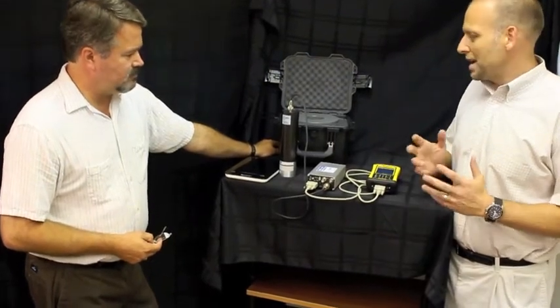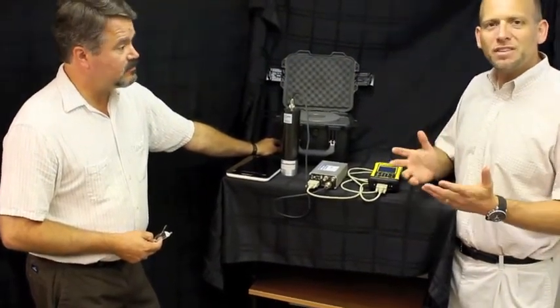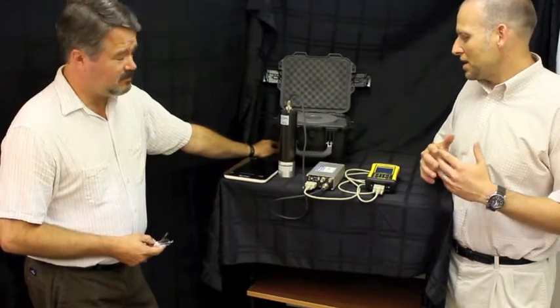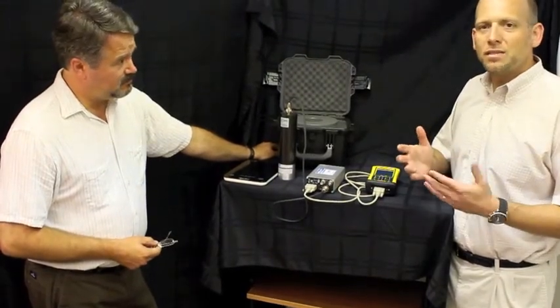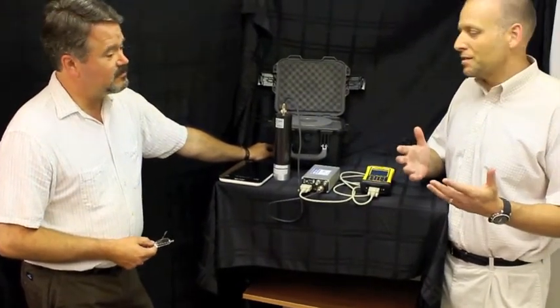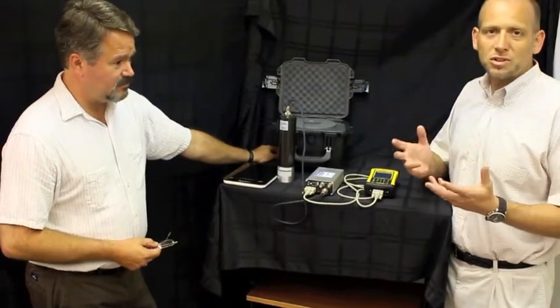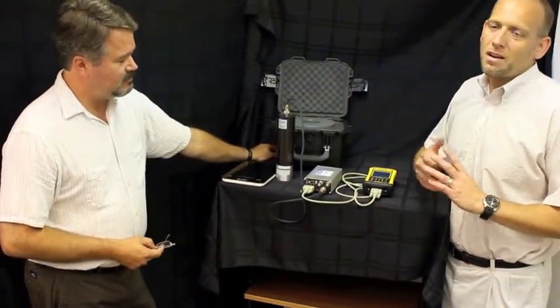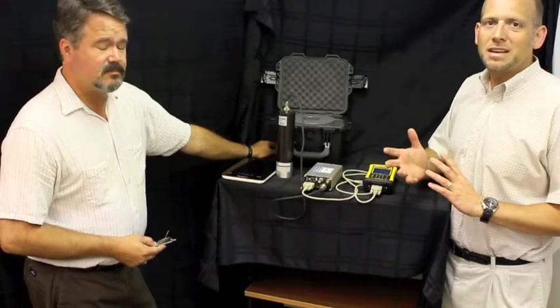The Food Safe is a completely portable analysis system that can be taken out into the field where very high performance quantitative measurements can be made of food samples, soil samples, or water samples almost in real time without the need to send your data back to a laboratory.